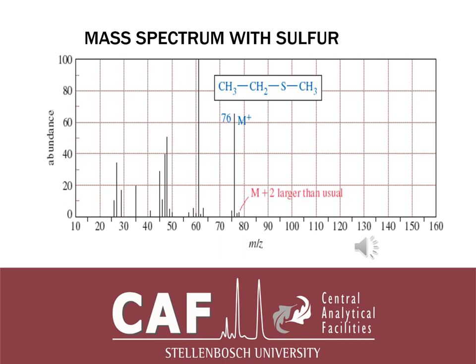Now, if you look at the spectrum there, you can see the most intense line is already onto the carbocation. Why?